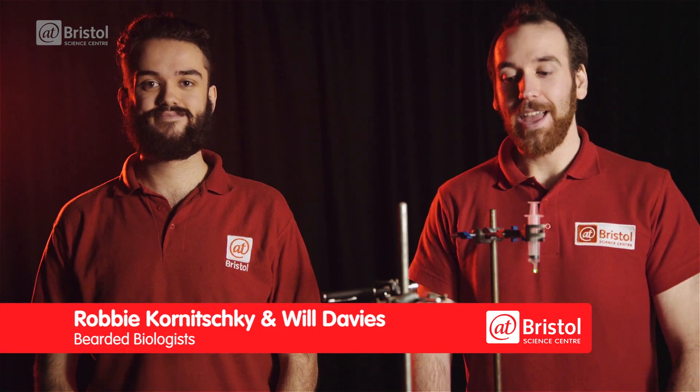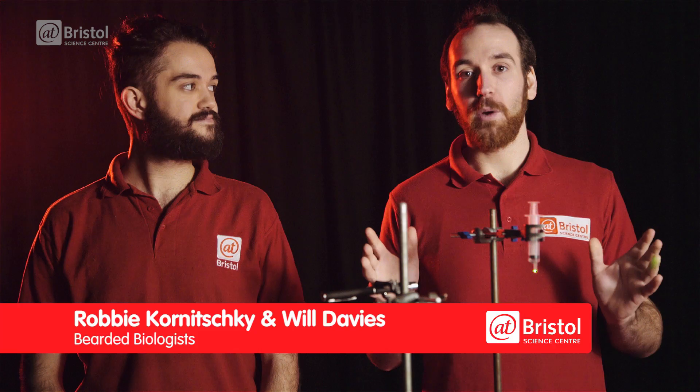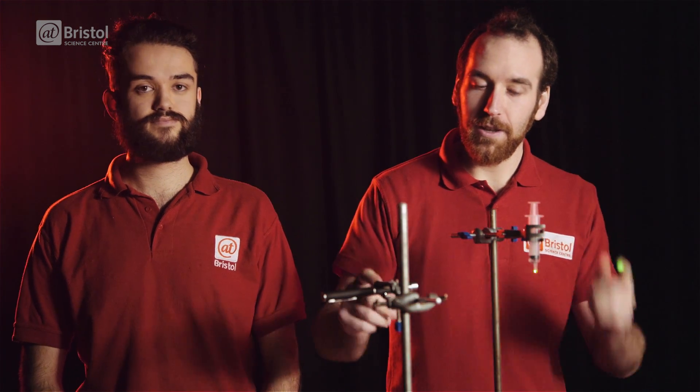Hello there, I'm Will. And I'm Robbie. And today we're going to show you how to make your very own homemade DIY microscope using just a laser pointer and a syringe.